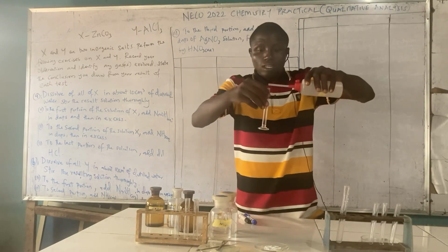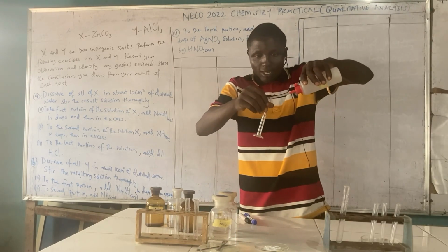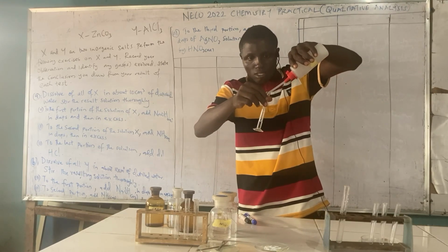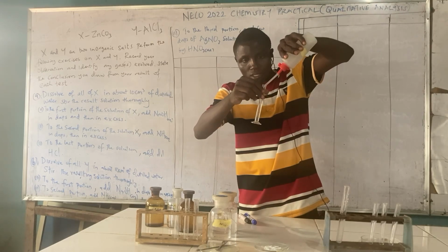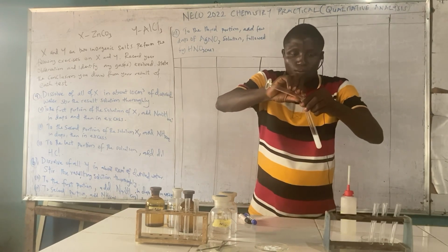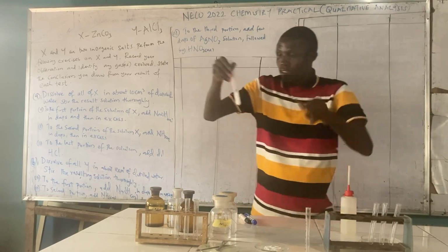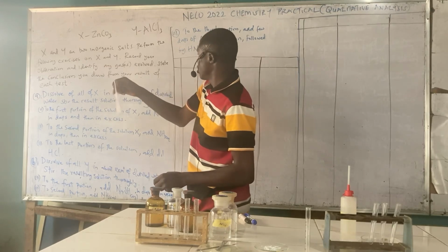10 centimeter cube of distilled water here we have. So now we have to stir thoroughly. Now when you stir thoroughly, what do you observe?